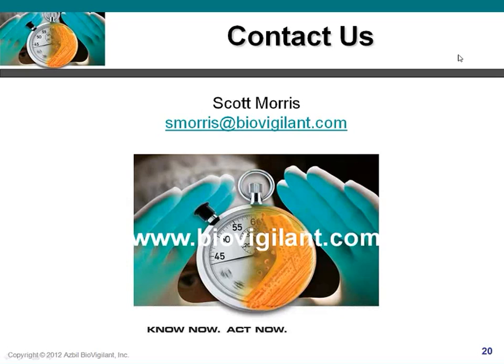That's a good segue actually to another question that just came in. Does the device need to be calibrated? If so, how and how often? So typically the device does need to be calibrated. That is very important to ensure that you're maintaining the accuracy and sensitivity that we have validated, the ability to detect fluorescence from a single microbe, and the ability to enumerate and size particles correctly. That performance does need to be periodically checked and recalibrated. We recommend a yearly calibration cycle, and most of our customers typically adhere to that. There might be certain applications or certain environments where some customers want a more frequent confirmation that the system is operating nominally. But generally, it's a year recalibration cycle.